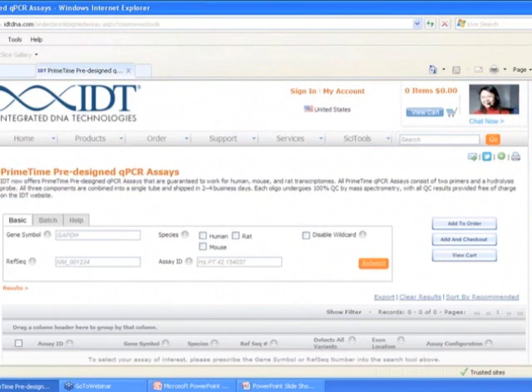Another question: do you have any suggestions for dealing with repetitive sequence in your amplicon? In terms of design, we also offer the dual-labeled LNA probe. Sometimes it's a little tricky, so I can't give you a generalized statement. It's a little bit up to looking at the sequence, but we try to find smaller regions which are unique, and if you have enough LNA bases, we modify with LNA, which increases the Tm, and so then we would make a dual-labeled LNA probe.